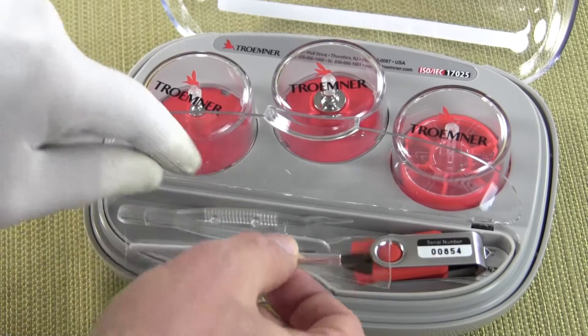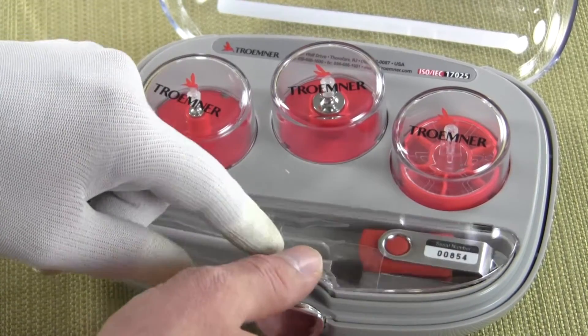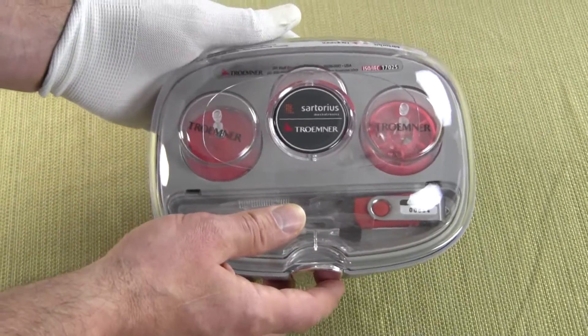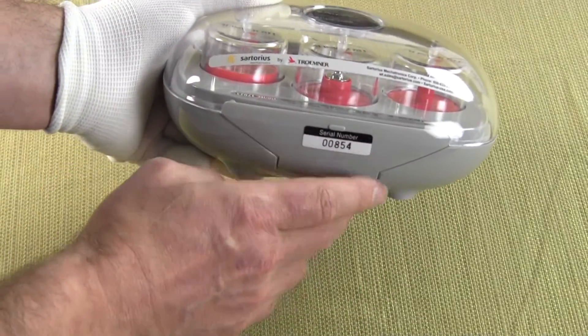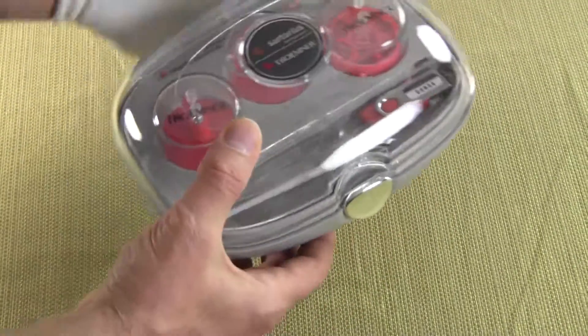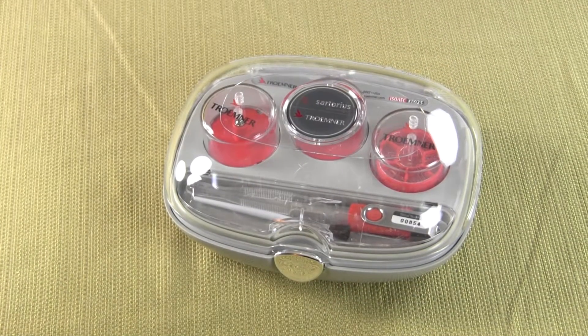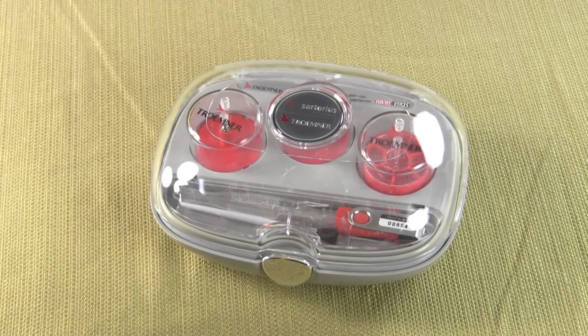We really recommend that anybody buying an analytical balance also buys one of these CALPATS. The CALPATS are made by Tromner and sold by Sartorius. We are Precision Weighing Balances — an authorized Sartorius dealer and also a Tromner dealer. The case is very nice, it comes with a serial number on the back, and you can buy these in weight sets ranging from 2 grams all the way up to 5 kilograms.